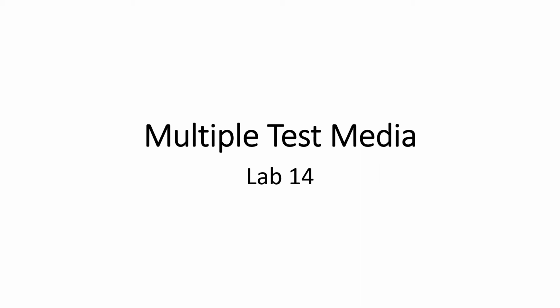This is the video for Lab 14, Multiple Test Media. In building the biochemical profile or enzyme profile for your unknown, up to this point you have used single test media. Single test media means that there is only one substrate in each type of media. This lab is going to utilize multiple test media.